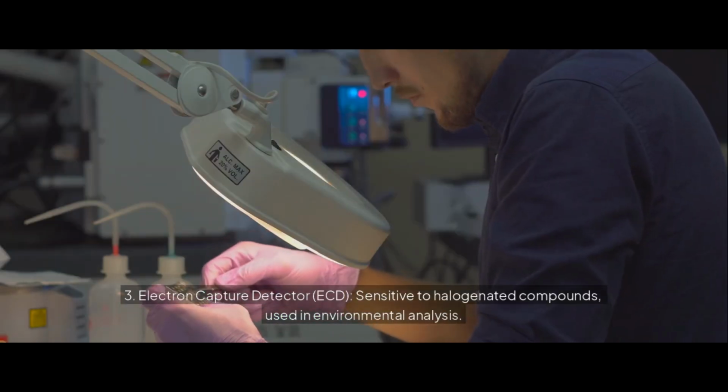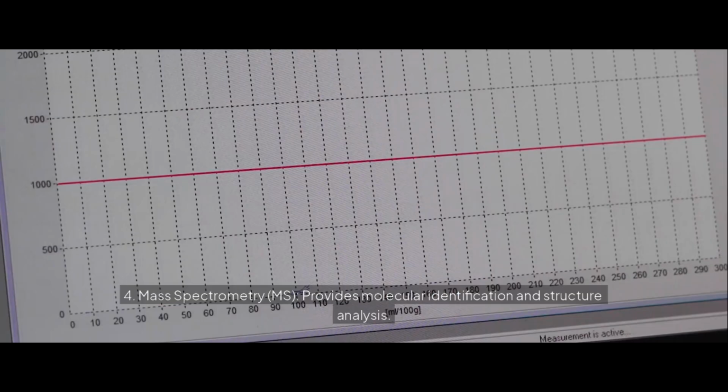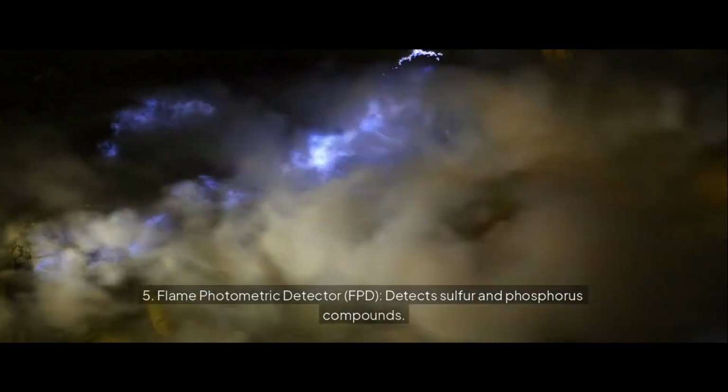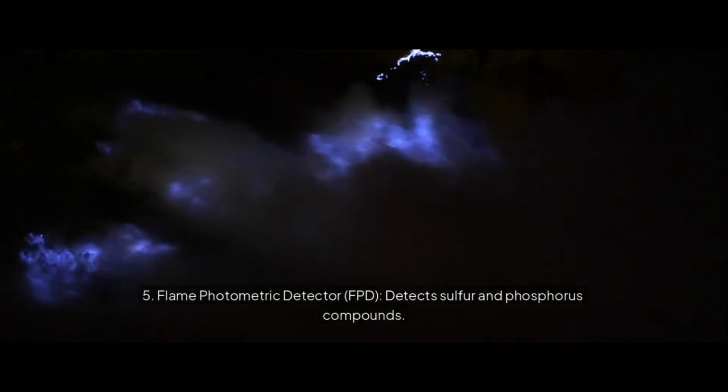3. Electron capture detector, ECD, sensitive to halogenated compounds, used in environmental analysis. 4. Mass spectrometry, MS, provides molecular identification and structure analysis. 5. Flame photometric detector, FPD, detects sulfur and phosphorus compounds.